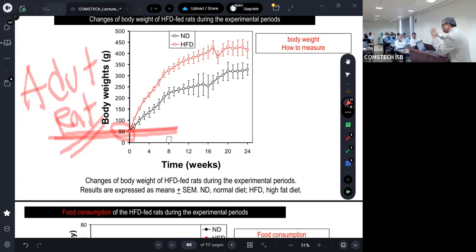So after lactation, initially they are all taking milk from the mother. Before going to the real food, on day 1, we give this food. It is the unique point. This is another tip and trick to make diabetes, pre-diabetes, or to make the rats obese. If you want to make them obese, there are options, but this is the best option. With this, all rats will develop obesity 100%. In other cases it will never be 100%. How to get it 100%?